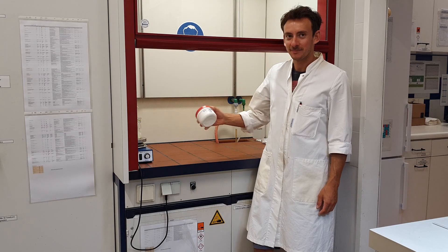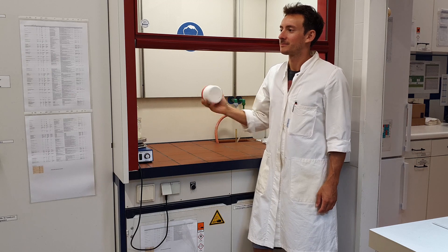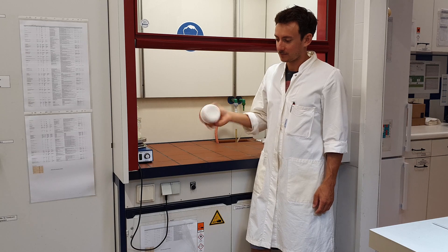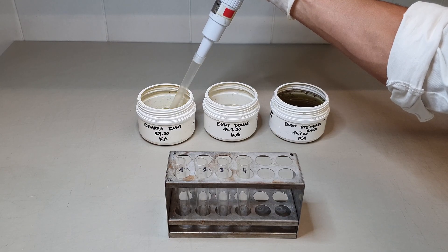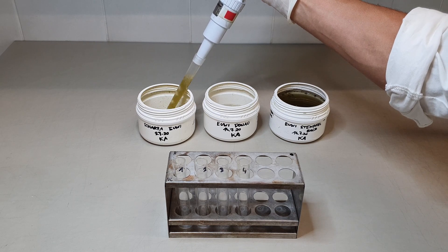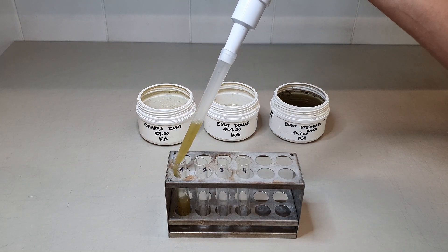In a first step, the collected field samples have to be well homogenized to get a representative subsample. This can be achieved by thorough shaking of the sampling container and the additional mixing of the sample by using a piston-operated pipette. Depending on the concentration of the original sample, transfer approximately 10 ml of diatom suspension into a centrifugation glass tube.